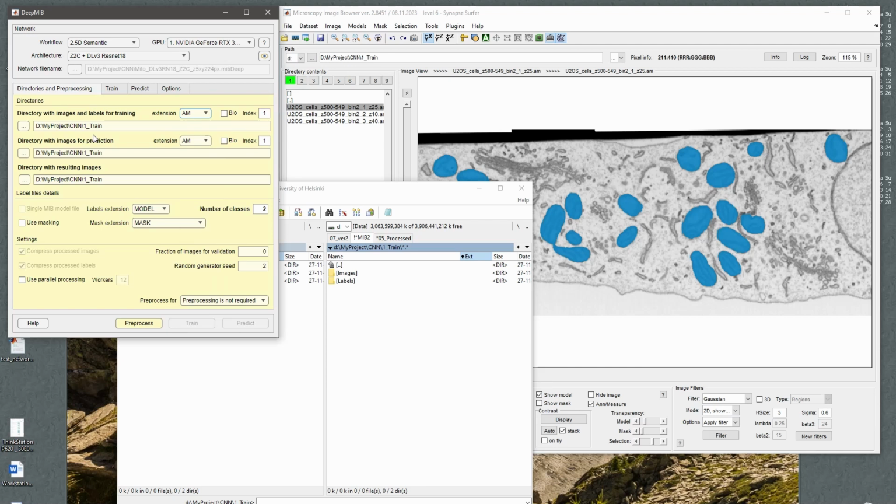The typical strategy, if you have some standard formats like this, is that I do not do any of the pre-processing, which is the other option here, and that was the standard way in the earlier versions of this tutorial. But these days it's way quicker. If it's a standard format, just use it directly without pre-processing. If it is one of these bioformats, then I would probably do the pre-processing. It will probably make life slightly faster.